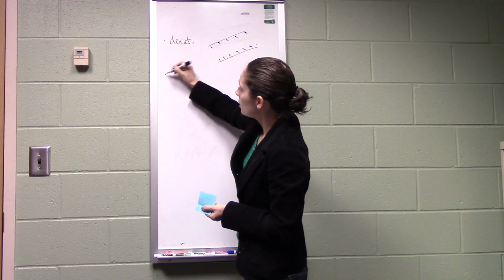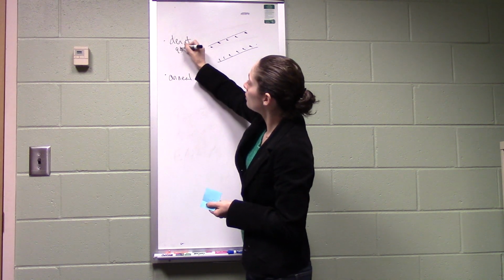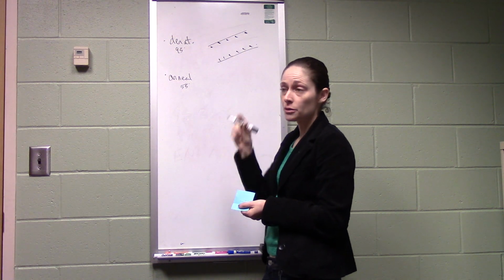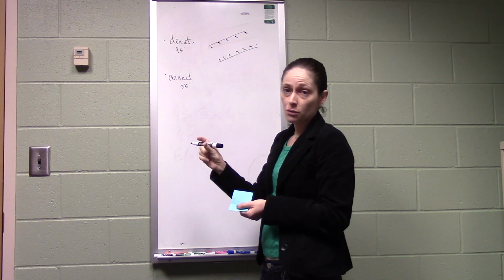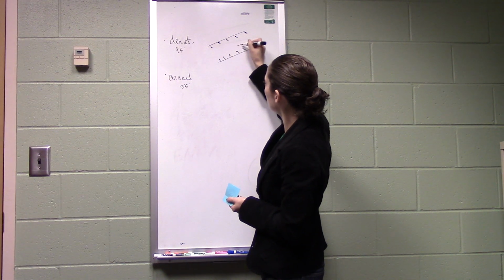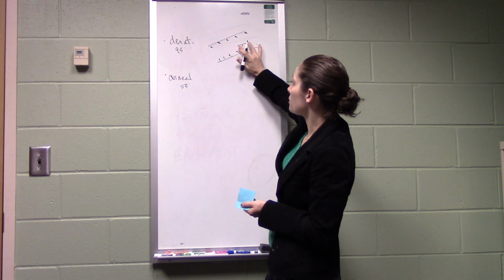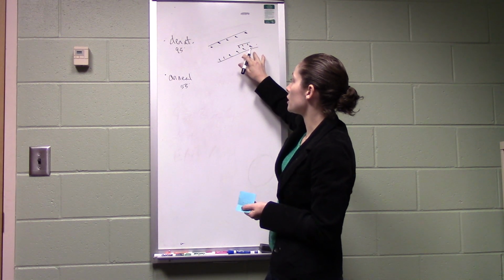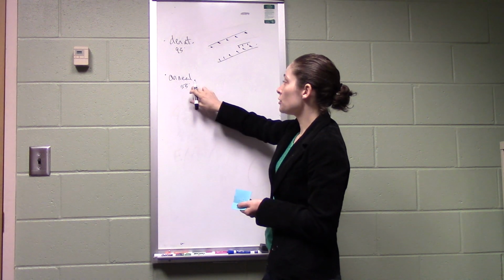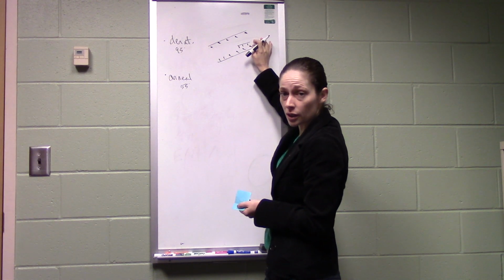After you denature, you cool it down to maybe around 55 degrees, and this allows your primers to anneal. Primers are short DNA sequences, right? Okay, during this annealing step, your primers are free to find their complementary sequence on your template and bind to it. Okay, so the temperature of annealing versus the melting temperature of your primers is really important.